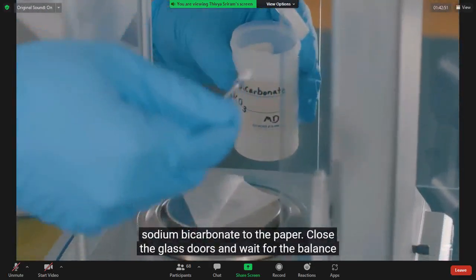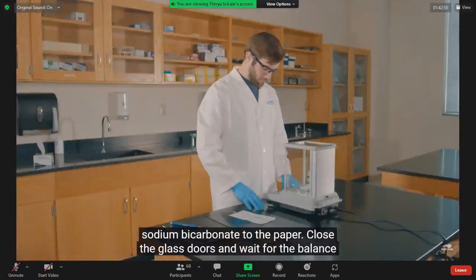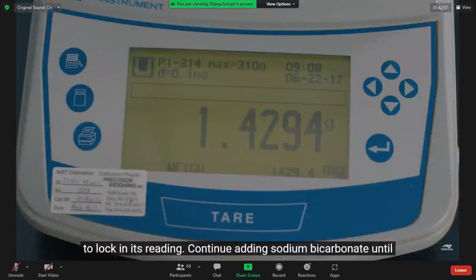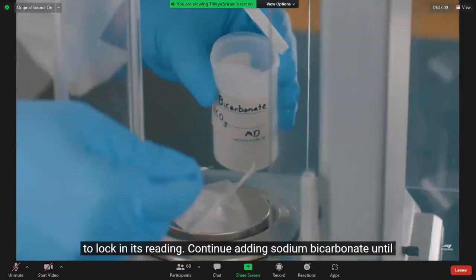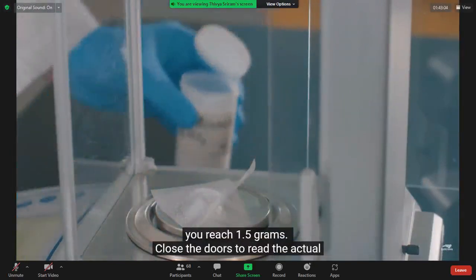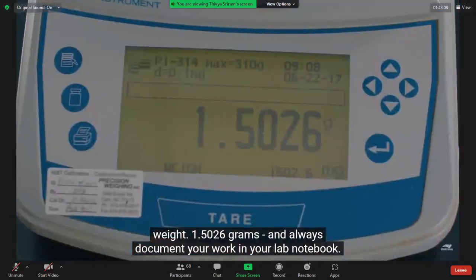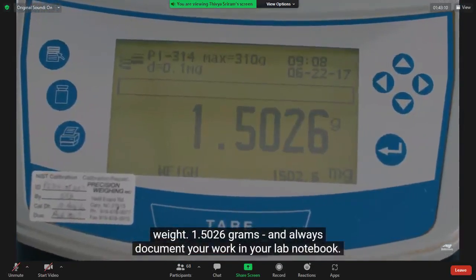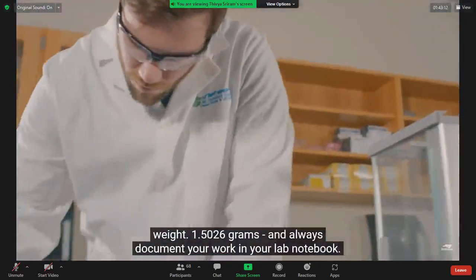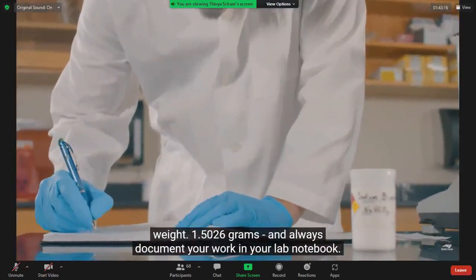Use a lab scoop to slowly add the sodium bicarbonate to the paper. Close the glass doors and wait for the balance to lock in its reading. Continue adding sodium bicarbonate until you reach 1.5 grams. Close the doors to read the actual weight. 1.5026 grams. And always document your work in your lab notebook.